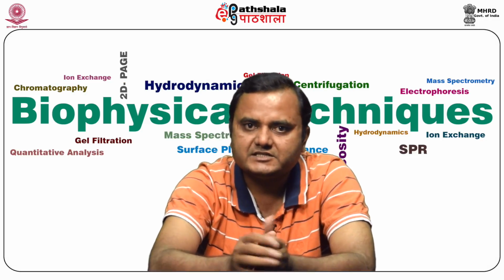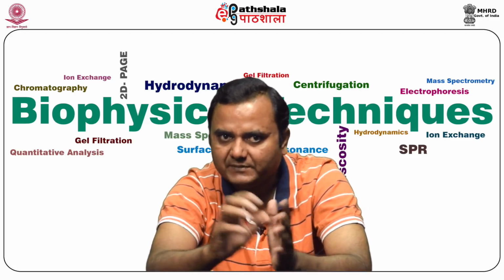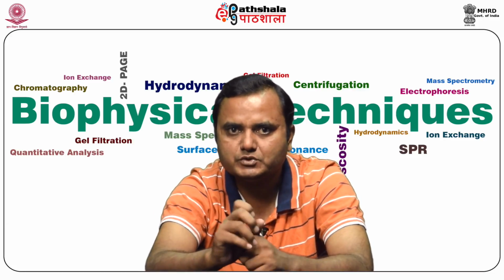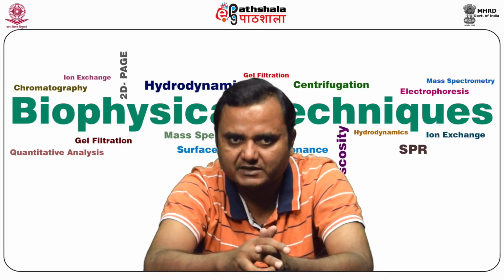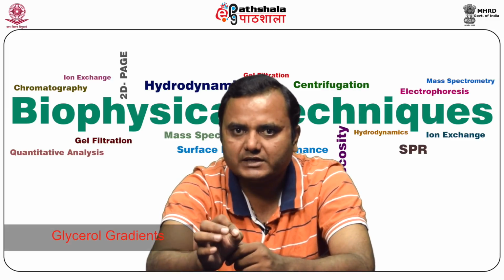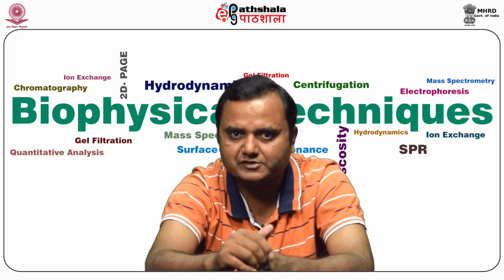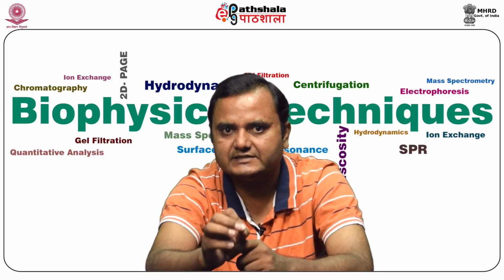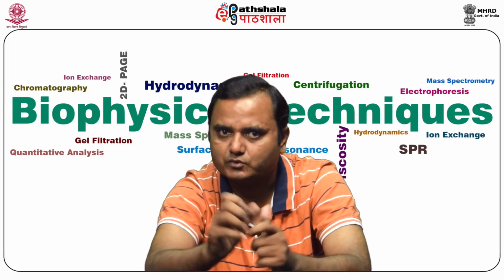To run density gradient centrifugation, media selection is a very important factor, and there are different kinds of media. First is the aqueous buffer, that is, a water-based buffer used to separate molecules with widely different S values. S is the Svedberg unit, for example, the nucleus from the ribosome. Sucrose or glycerol gradient is used as a cushion for isokinetic or rate zonal centrifugation. Fixed concentration or linear gradients increase the density and the viscosity, decreasing the sedimentation rates. That's why sucrose is used.